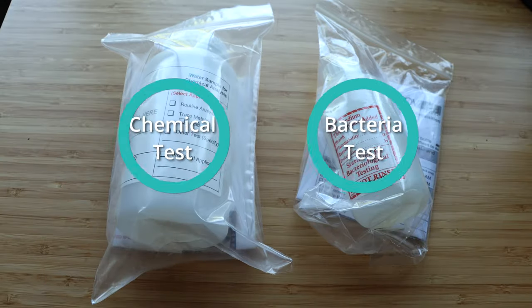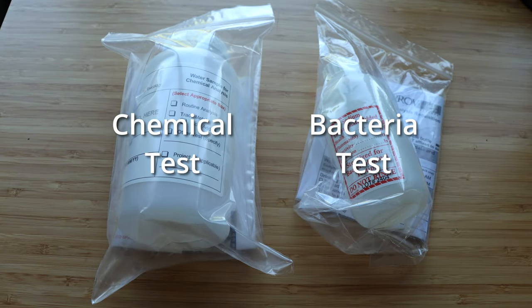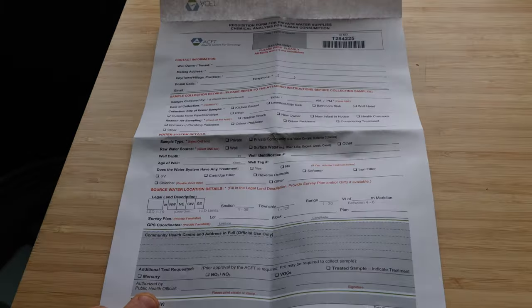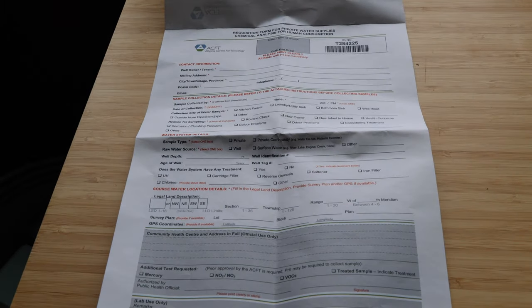Now that I have my kits, I need to follow the provided instructions to collect samples, then drop them off again. I was advised to collect my samples in the same day that I dropped them off to ensure accuracy.